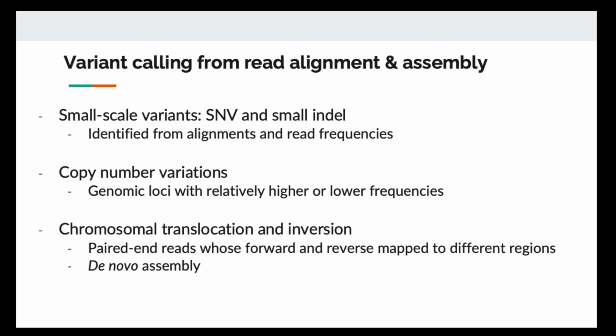But if we want to detect copy number variation, like if we want to know whether we have 2 copies or 3 or 4 or 5 copies of a gene, and we can only sequence the gene body and the copies look the same, then with short-read data we have no idea if there are 5 copies in the genome, because we only see the body of the gene.